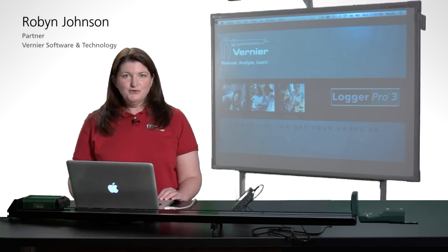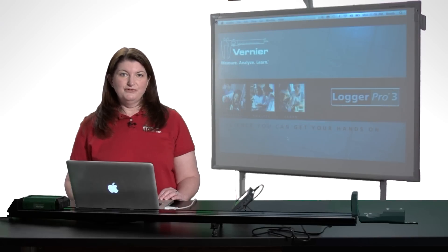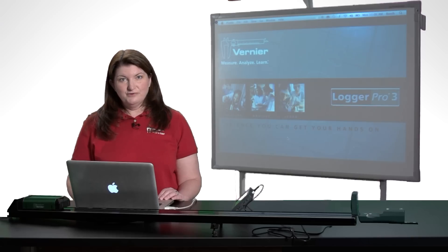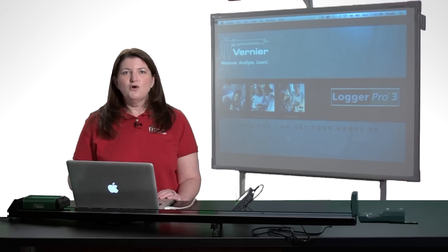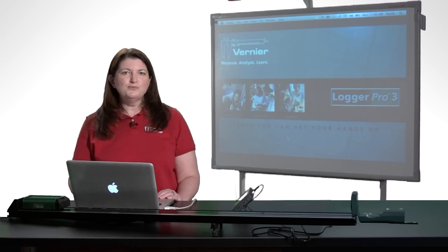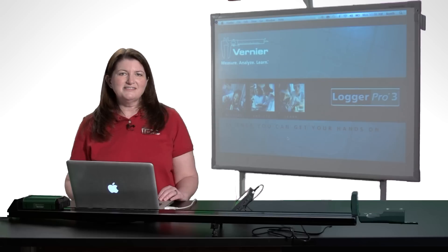The LabQuest Viewer allows you to view and control a LabQuest screen right on a Windows or Macintosh computer. This is very handy in the classroom as you can display your LabQuest screen from a demo in the front of the class or maybe show one of your student groups LabQuests up for the whole class to see.